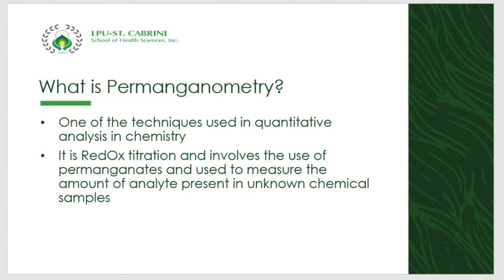So, potassium permanganate is also known as your mineral chameleon. Potassium permanganate is probably the most widely used of all volumetric oxidizing agents. It is a powerful oxidant or powerful oxidizing agent.